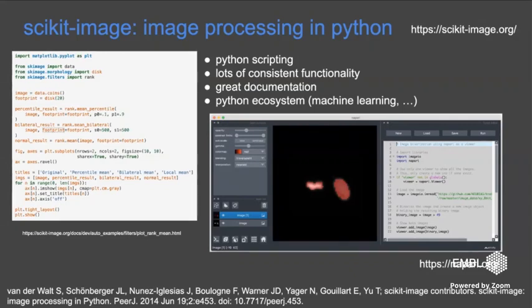And the other really good news is that now, since maybe already a couple of years, there is also a really good viewer for images in Python. This was always a problem, that it was hard to look at images in Python and people would then open Fiji. But now you can directly from Python launch this Napari viewer, which is really great. To look at images, it is as convenient, or maybe, depends, you might find it even more convenient than Fiji. And you could even have a script editor inside where you can write your code. So this Scikit-image Napari ecosystem is also highly recommended if you like to write code.